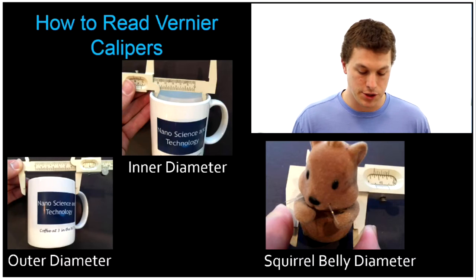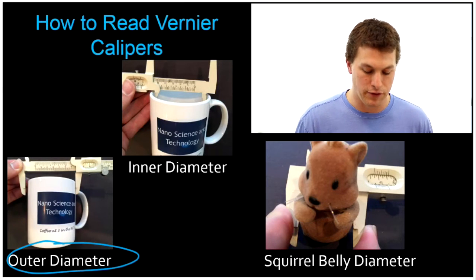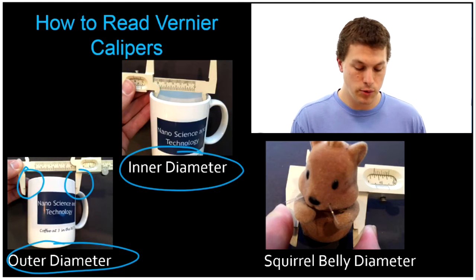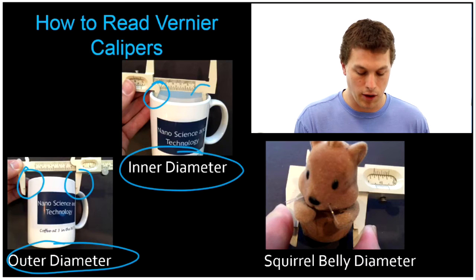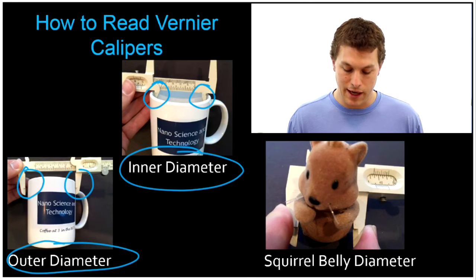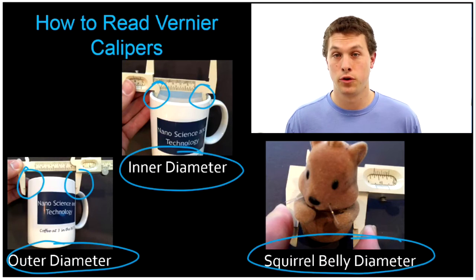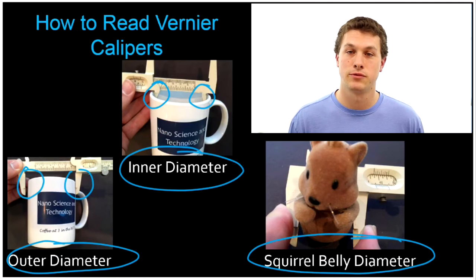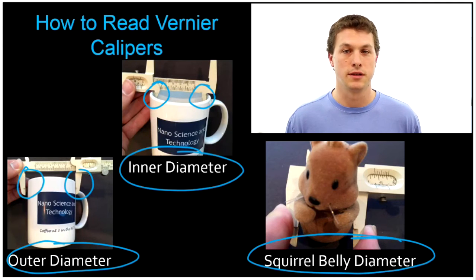We're going to measure the outer diameter of a coffee mug using these big claws on the front, the inner diameter of a coffee mug using these little back claws, and finally we're going to see how fat our squirrel is by measuring the squirrel belly diameter, which is probably the most important example. We're going to do three examples of reading vernier calipers to the correct number of sig figs.